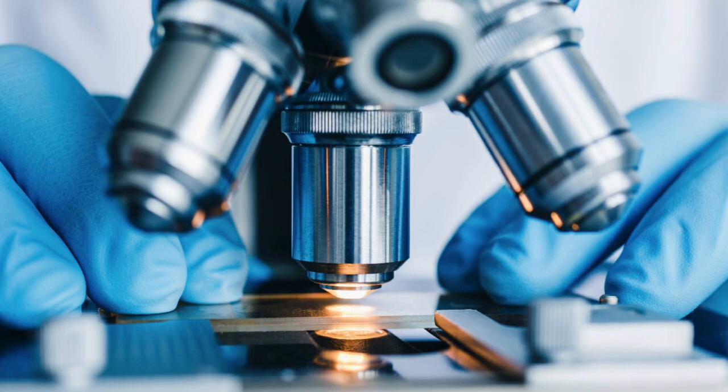The objective lenses are located closest to the evidence and provide the primary level of magnification. Forensic microscopes usually have multiple objective lenses that can be rotated into place, allowing examiners to switch between low, medium, and high magnification. This is important because scientists often start with lower magnification to get an overall view before zooming in and seeing the finer details.